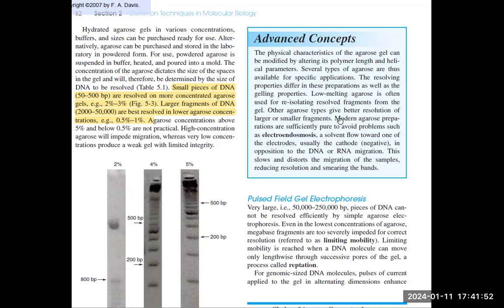Let's move towards the problem when it comes to the purity of agarose. Nowadays, we don't have much problem on the purity of agarose, especially because they are produced commercially. However, if we make mistakes and inadvertently put contaminants into our agarose gel or agarose preparation, what will happen?